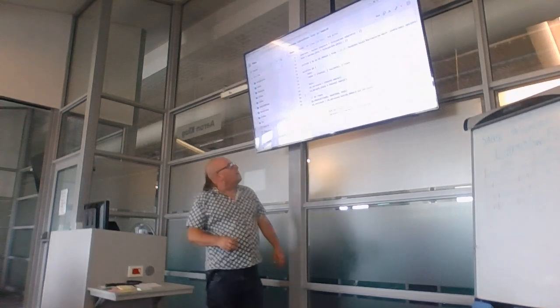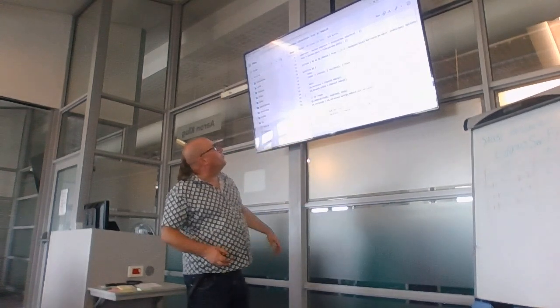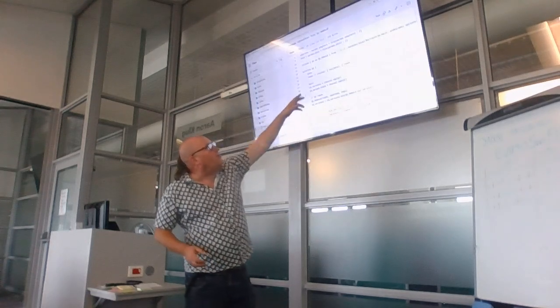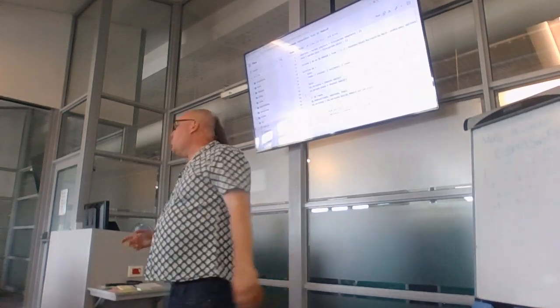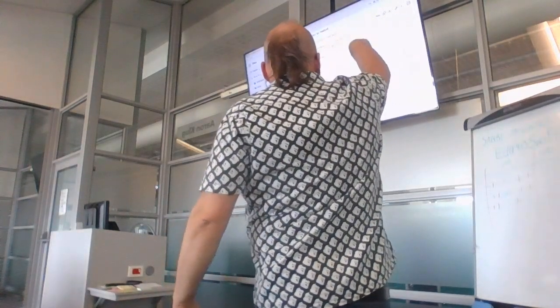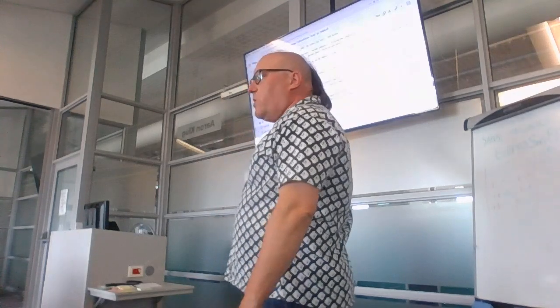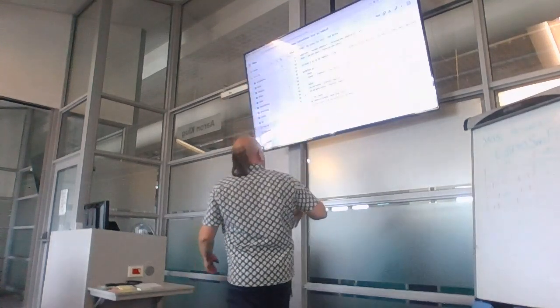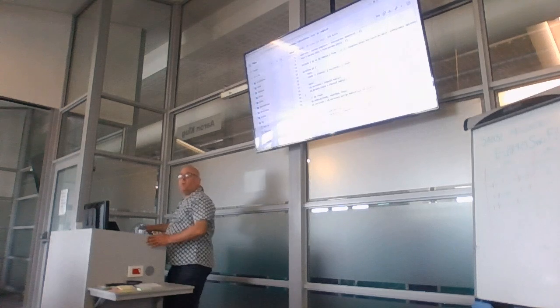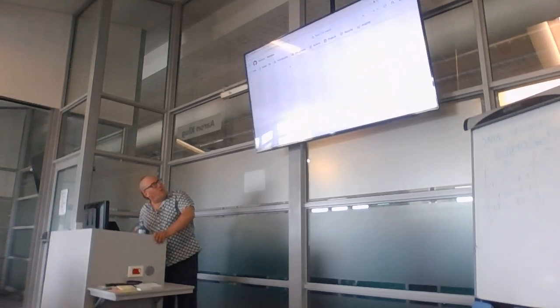Okay? And then it uses a QC module, which is running from modules. You can follow it further. It says that the QC module comes from the modules directly. Modules local back to up here QC. Okay? So this thing, QC, the sub workflow, is just running a module called QC. Okay? So let's keep chasing the definition of things. So it says that that is in modules local QC. Let's go find modules.